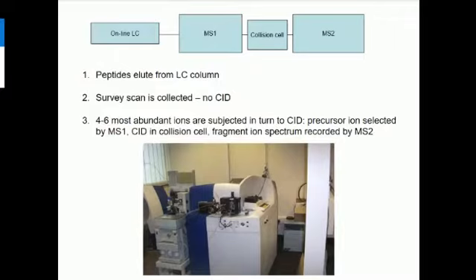So in that way, even though we've got thousands of peptides in our mixture, we'll get MSMS, so tandem mass spec, spectra for each of those peptides. Does that make sense? Yeah, okay, hopefully.